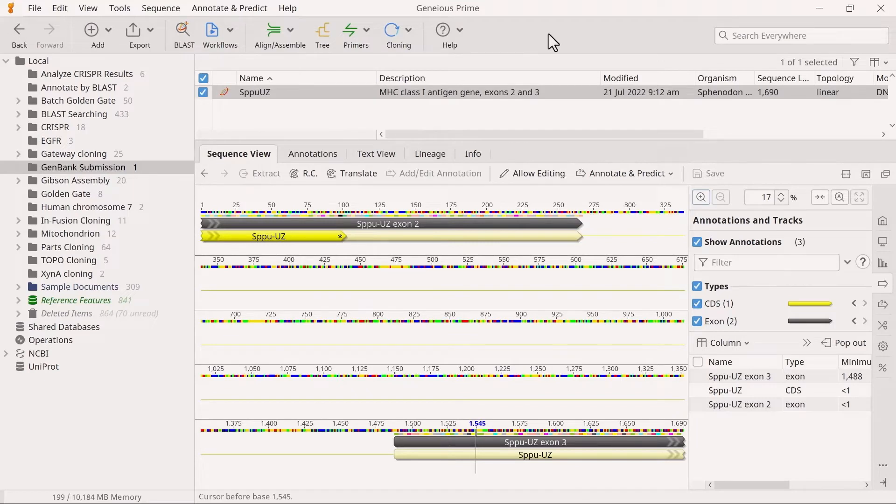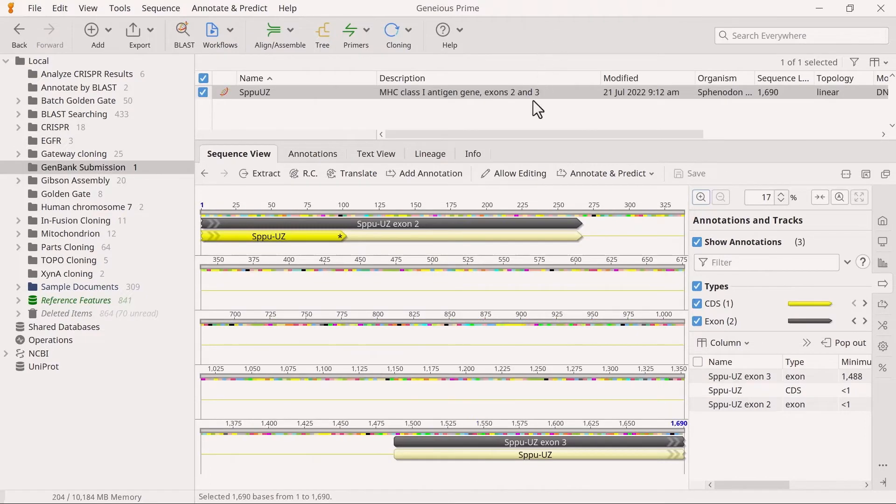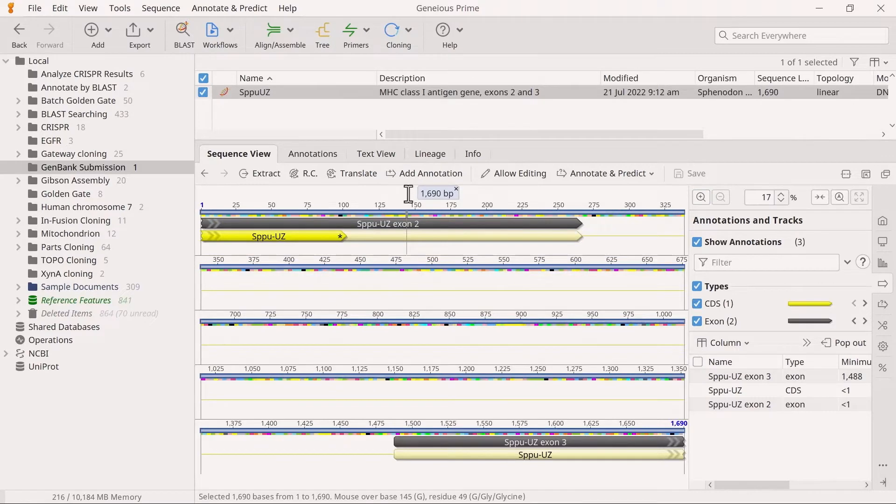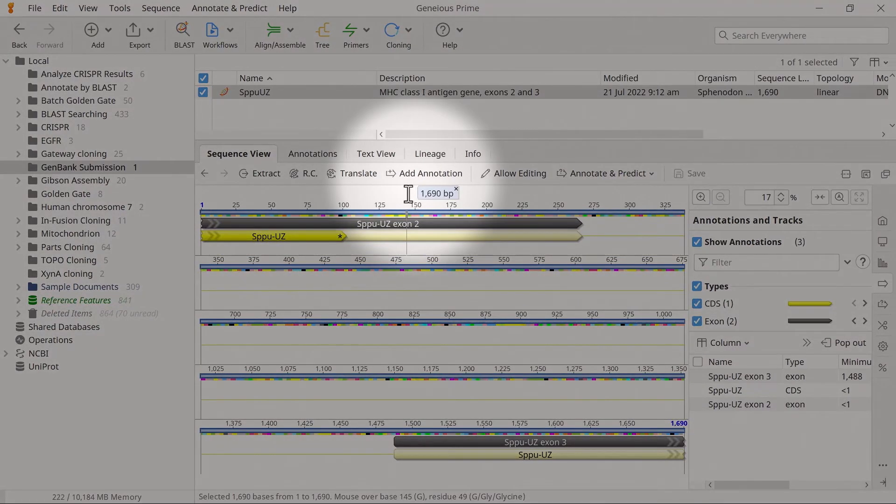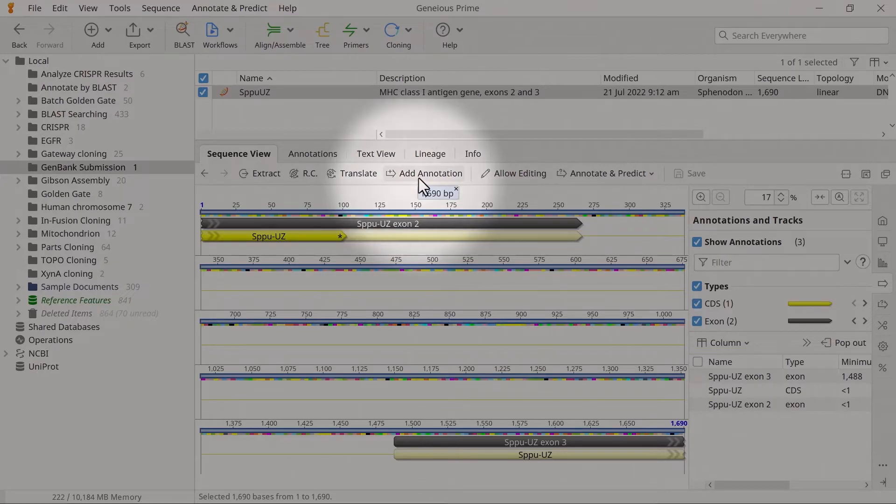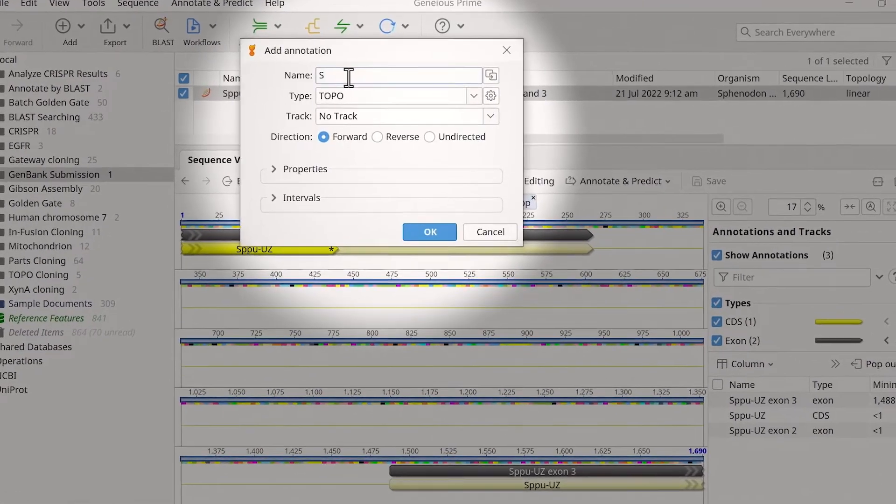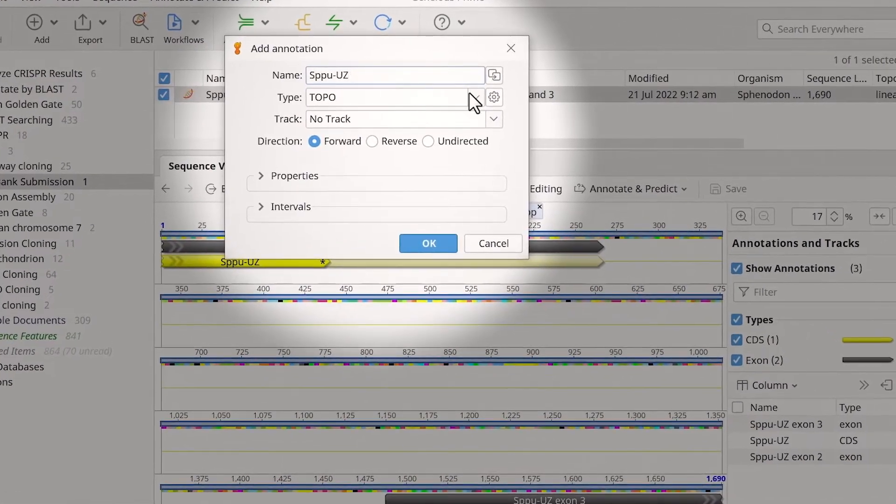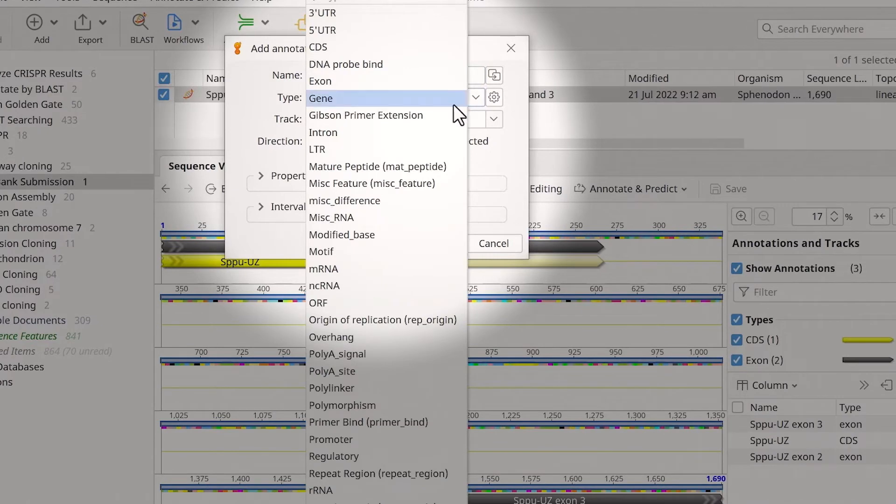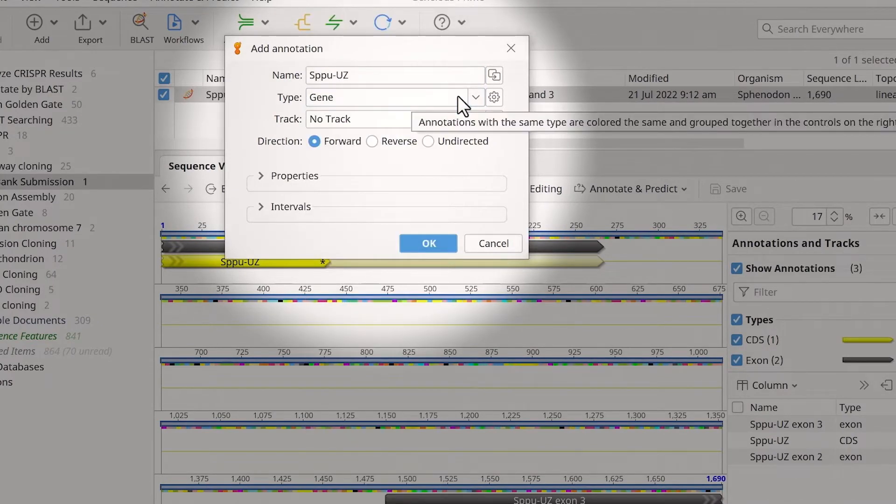This example already has a coding sequence and exon annotations. However, for submission to GenBank, protein coding genes also require a gene annotation. To add this, select the entire gene sequence by pressing Ctrl plus A or Command plus A for Mac, then click Add Annotation. In the new window, enter the gene name and change the type to Gene.